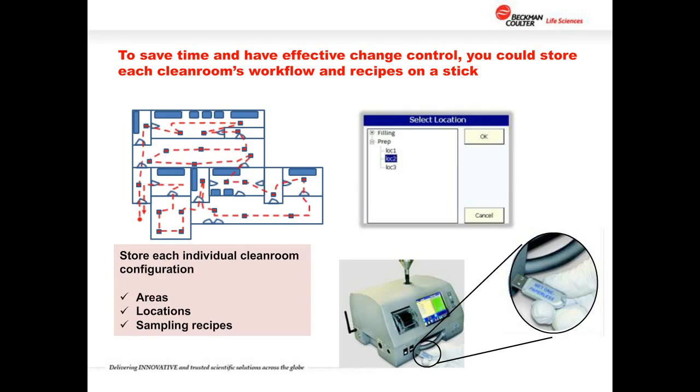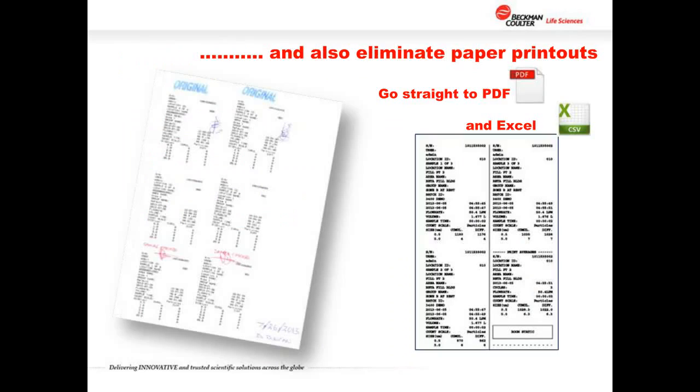So you're certainly taking the reading, the instrument's recording as it might have done previously, but now there's a lot more information available and a lot more information processing available on the instrument itself. So it helps in the whole movement of the information. So eliminate the paper printout, electronically create a PDF in the machine, and maybe an Excel output.